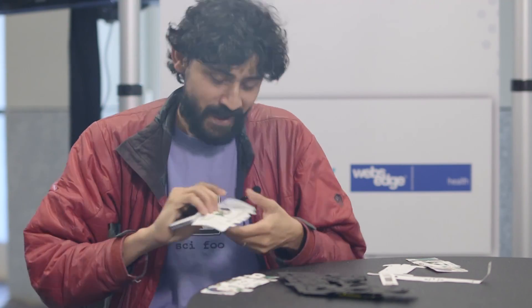Fascinating. It brings accessibility to science, but also may end up saving lives at the same time. It's wonderful. Thank you so much for showing it off — the Foldscope. Dr. Prakash, we appreciate you being here. Absolutely.